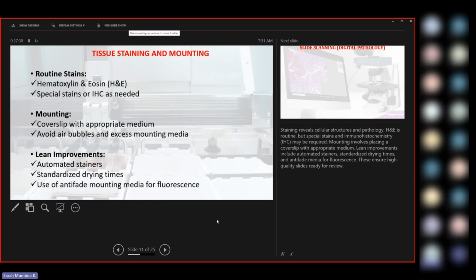First you clear the wax, do hydration, or bring the section to water, then stain with the hematoxylin. The book says 7 to 10 minutes. Check what will work for you. You will have to do control runs for the staining, so that you'll be sure. If I do 7 minutes, it will work for me.